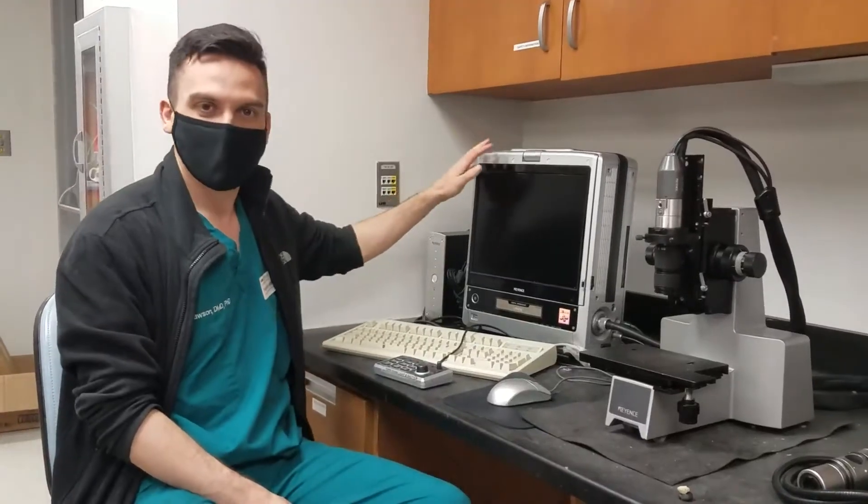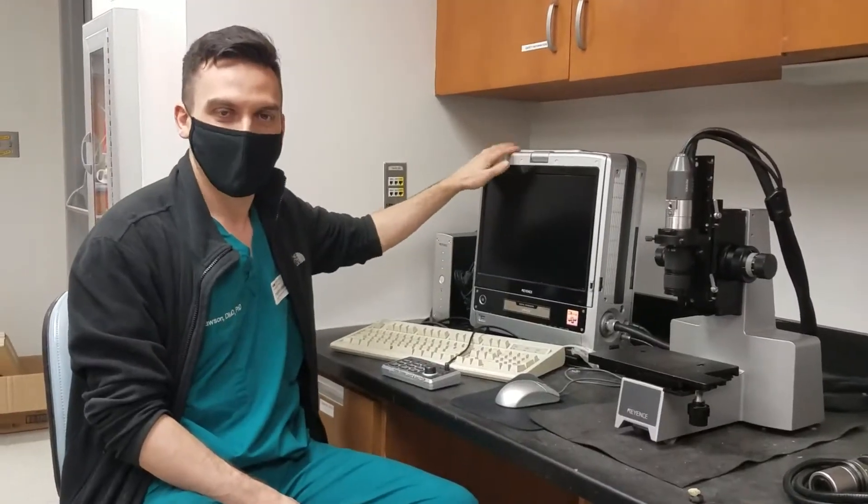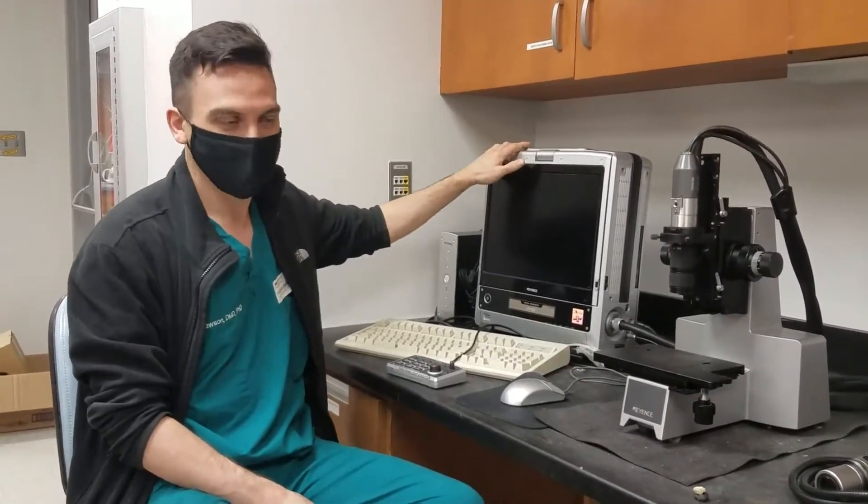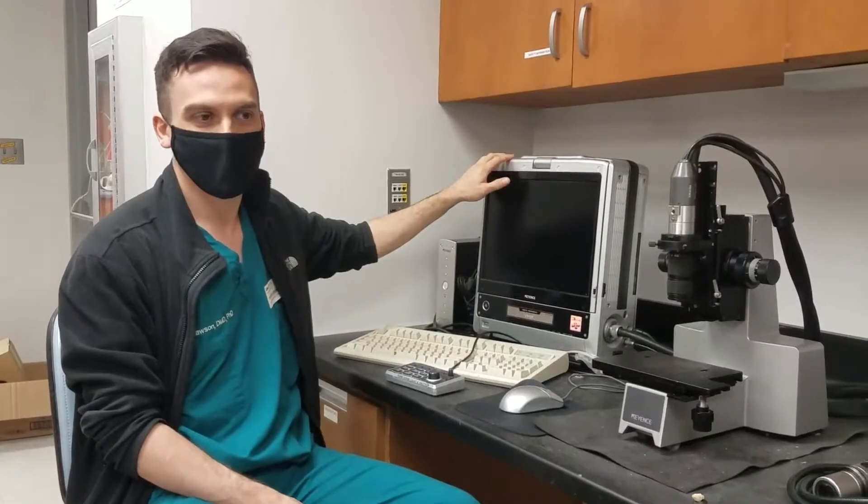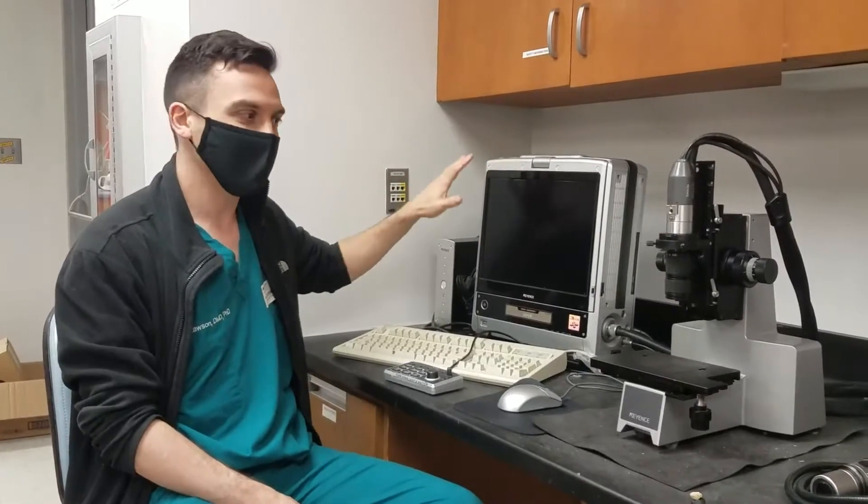This is the Keyence Digital Light Microscope. It's just a light microscope, it's not SEM.